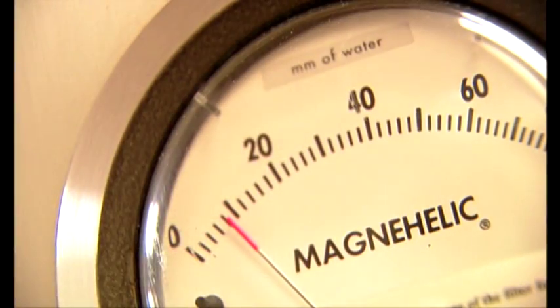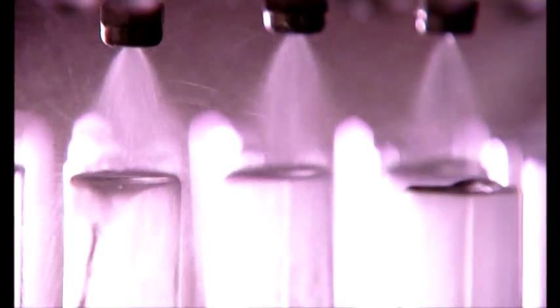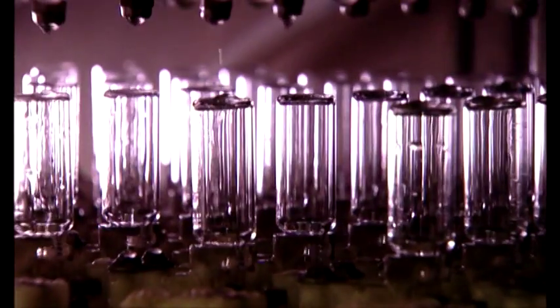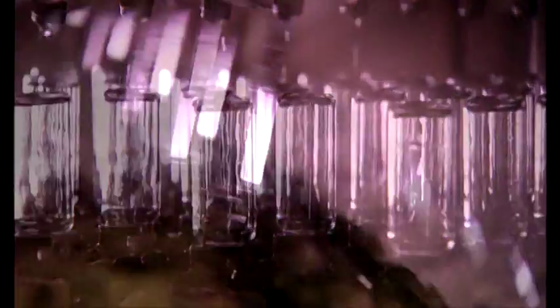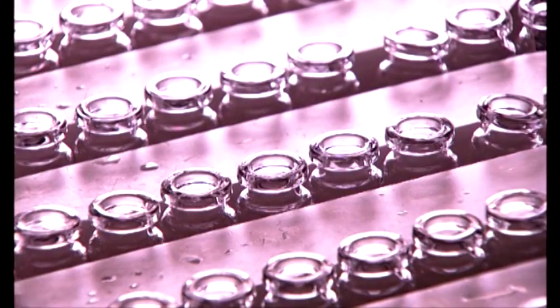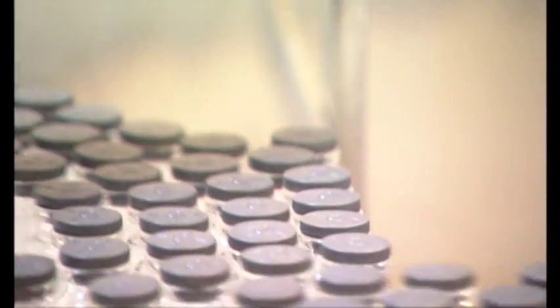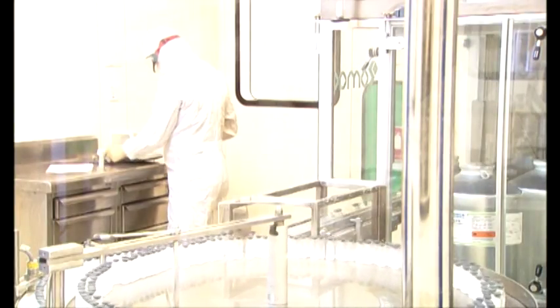Our injectables plant of cephalosporins is built online, from the washing of the vials and sterilisation units to the filling stage in a sterile environment, to rubber stoppering of the vials, capping, labelling and final packaging. Personnel follow very strict gowning procedures and regularly undergo training in order to protect the product and maintain sterility throughout the process.